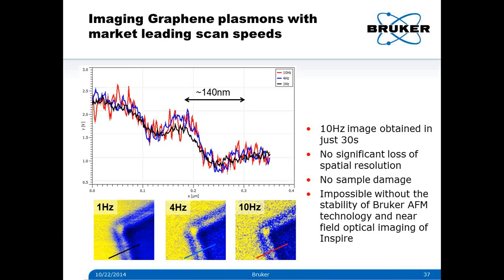So in general, I would say just a few minutes for a good image with good signal to noise. But then again, it depends on the features that you look at and the strength of, let's say, the absorption features. But in general, just a few minutes for these scans. And you can accelerate it if you go to 10 Hertz, but then you lose in signal to noise.